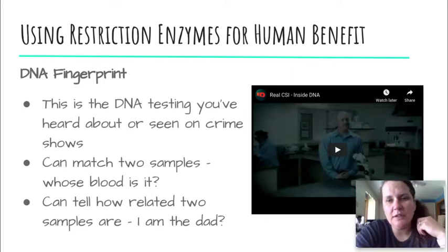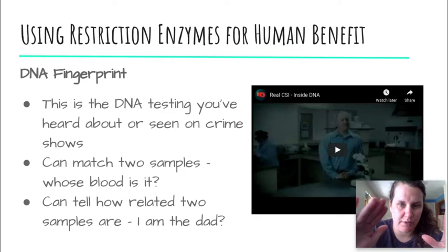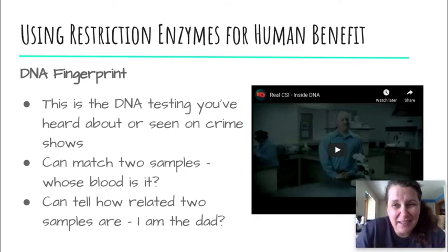Your DNA fingerprint is what we use certain restriction enzymes to cut DNA in certain places, and then we put it into this gel and put some electricity on it, and then these bands move. So your DNA fingerprint is literally your DNA that is cut up using these particular restriction enzymes. So it's not the same as your fingerprints. They're like two different things, but they're similar in that they are both unique to each person alive. Nobody else has your same fingerprint pattern. Nobody else will have your DNA fingerprint pattern.